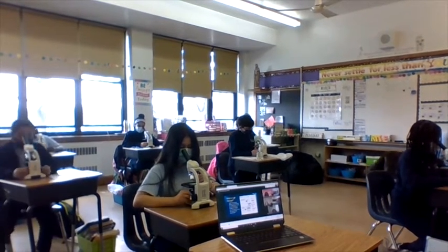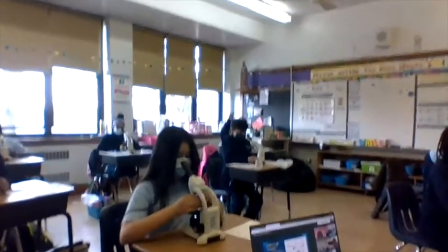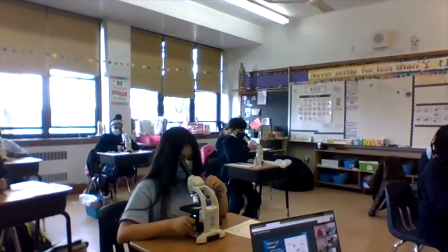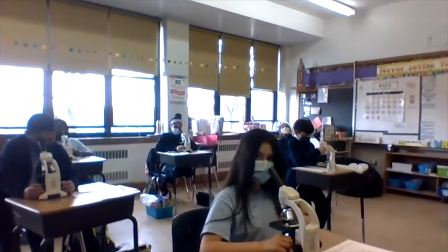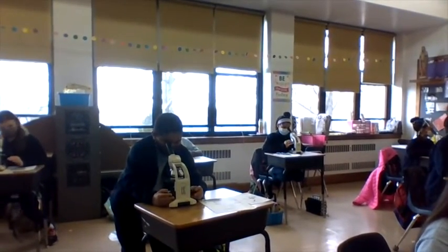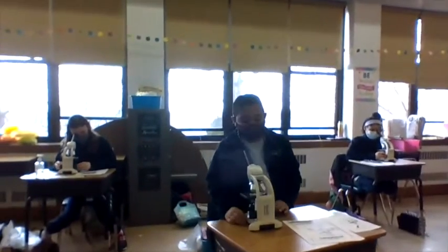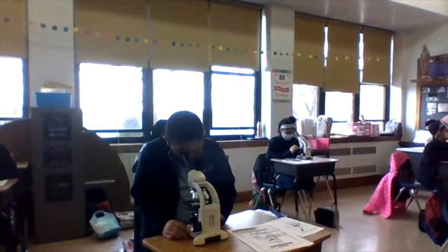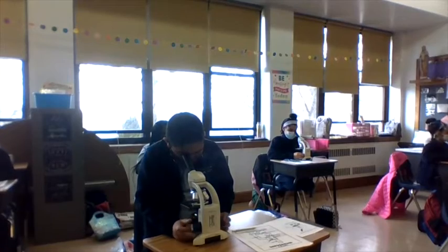You could go, start. Make sure your light is on. Good, Cheyenne. Keep working with your knobs. You may not see it right away. You may not see it on the red. You may have to magnify it. Oh, I see some. Use the coarse knob and then the fine knob. Good job, Brian. Oh, it's really cool.